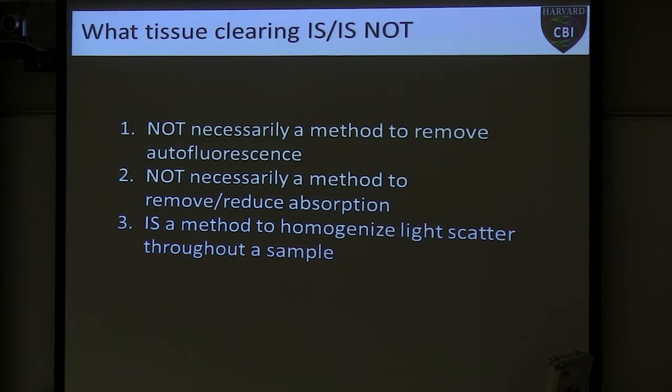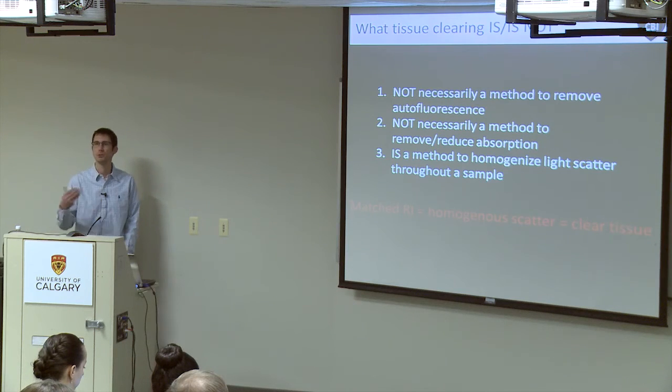In a glass of water, that light scatter is very homogeneous, and there's a lot of destructive interference in the lateral or reverse directions to the initial light path. But in milk, there isn't that destructive interference. Light just goes everywhere. And so the easiest way to think of this is whenever you have a mismatch in refractive index, so for example, in milk, it's when you're going between lipid and water.